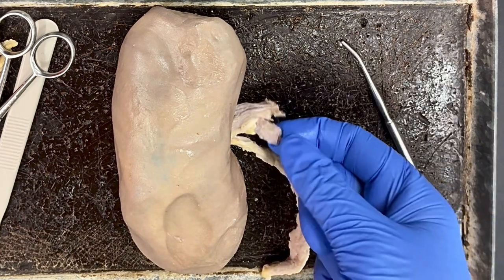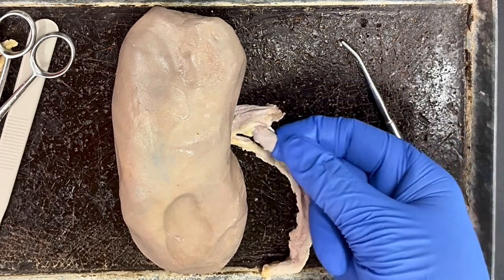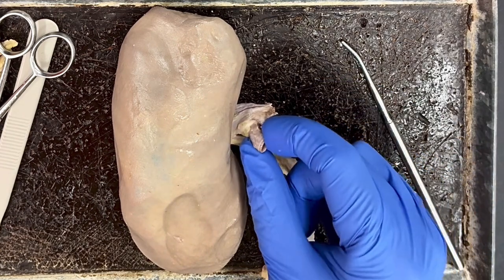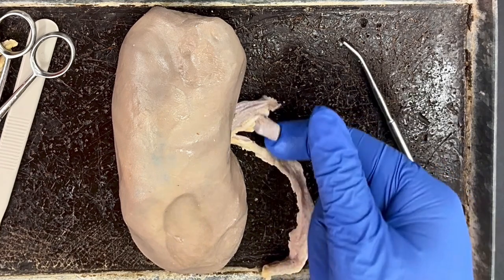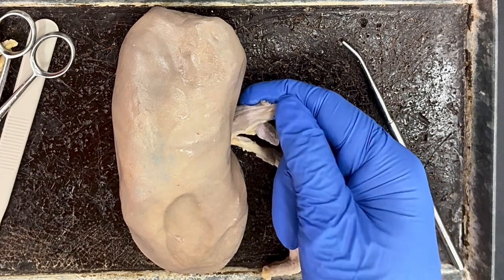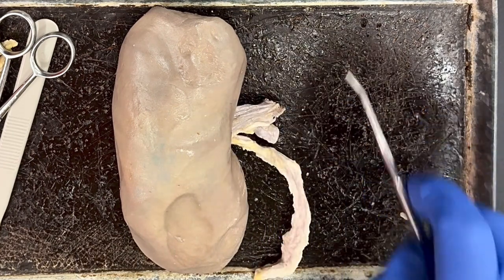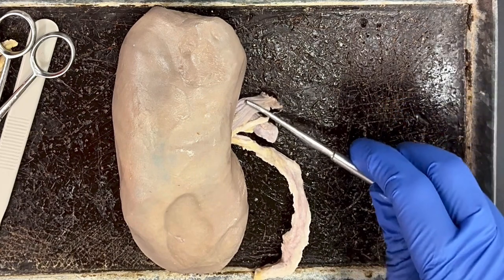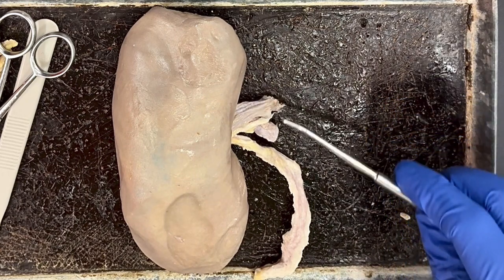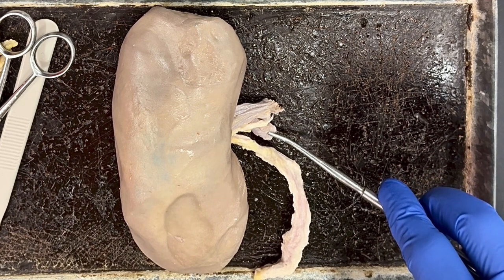And then just by touching this vessel and comparing it to the other one, this one is much tougher. If I look at it, it has a rounder structure to it. And then this one is more thin and flattened. That's how, again, I can tell that this thin flattened vessel is the renal vein, and this thicker rounded one is the renal artery.